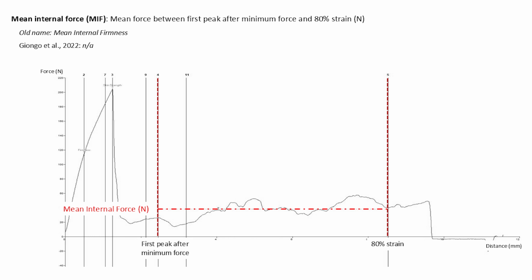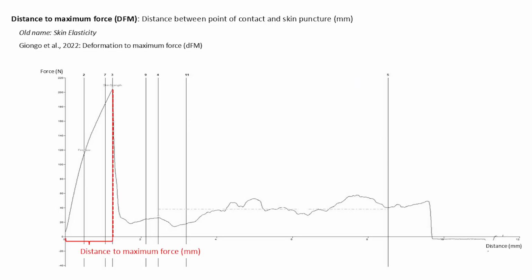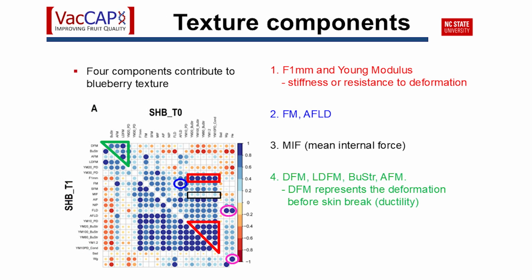The third component is the mean internal force, or the MIF. This measures the force while the probe is inside the berry going through the pulp. The fourth component is DFM, or the distance to maximum force, which represents the deformation before skin break, or the ductility. These 4 components could be used to predict both the sensory firmness and the post-storage texture.